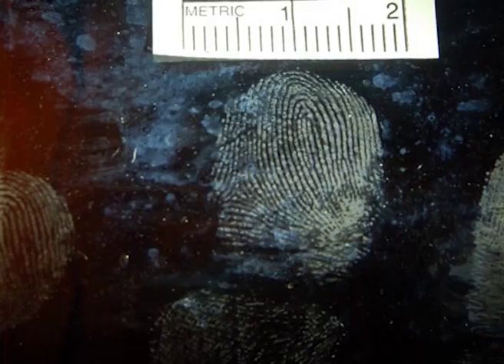With conventional chemical developing reagents, the latent fingerprints on the surface in question are first visually searched and then the relevant spray or powder formulation is applied. However, while using the iodine method, there is no need to first scan the surface. Iodine vapors on their own get preferentially absorbed on the fingerprint residue, revealing the ridges.